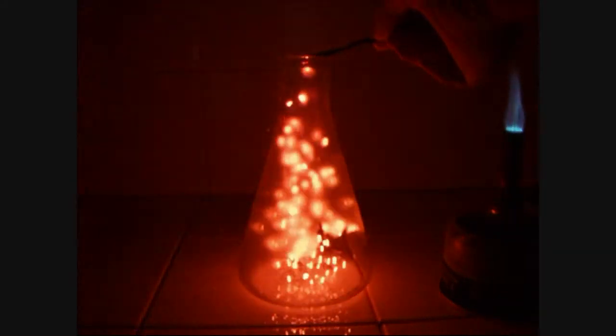During the second trial, you can see the Erlenmeyer flask is a bit foggy from the inside. This is due to the reaction products of the combustion of ammonia — it's simply nitrogen and some water.